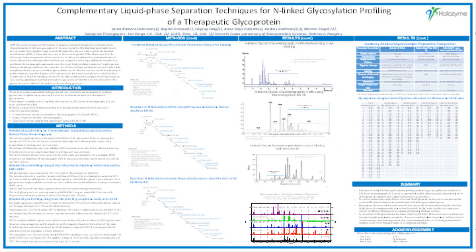Thank you. The next question is, is it necessary to do triplicate analysis for each sample? I don't believe we do triplicate analysis for each sample. I would have to look at our validated methods, but I don't believe we do. We do have bracketing standards where we have up to triplicate of our bracketing standards in our methods, but for our individual samples, we do not.